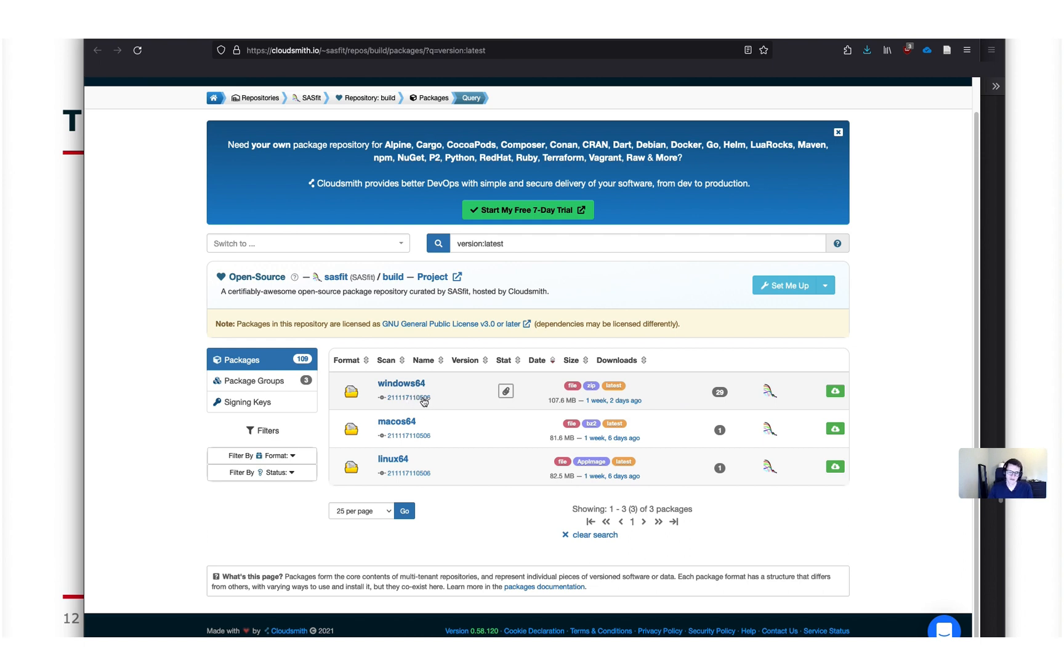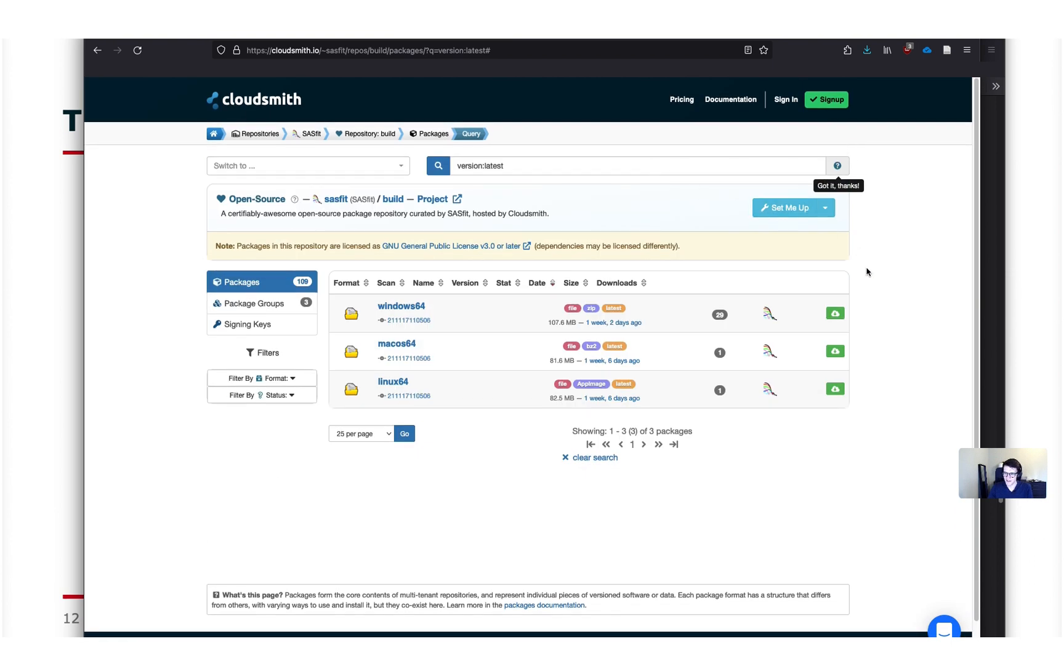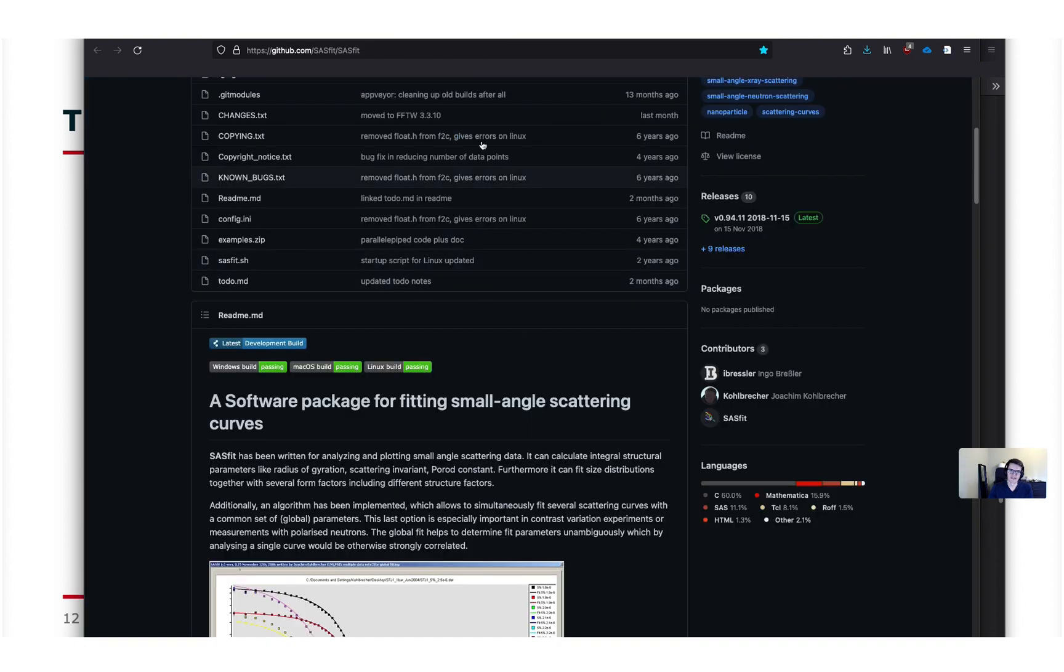The latest build of the development versions are uploaded here. This means that sometimes they might have issues or still some problems. But in this case just pick an older version. It's just because these builds are done automatically when something in the source code is changed. If you want to be safe just pick the latest stable release here on the main page.